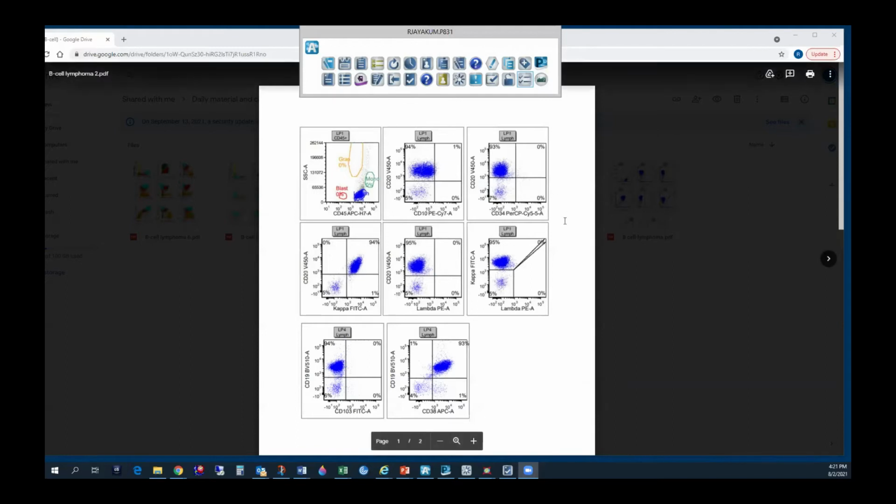That's true. I'm not used to seeing the lines. I mean, they are helpful, but I would rather know where everything would sit and how it looks. More relative, everything is relative. So you don't mention the percentage of positive cells then, because these lines will decide that percentage that I was used to mentioning in the report.